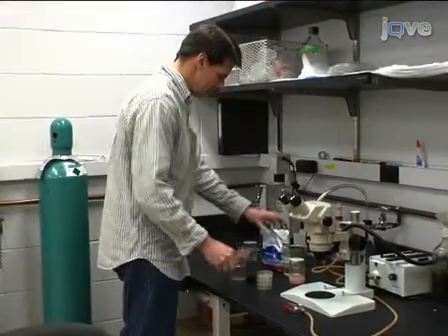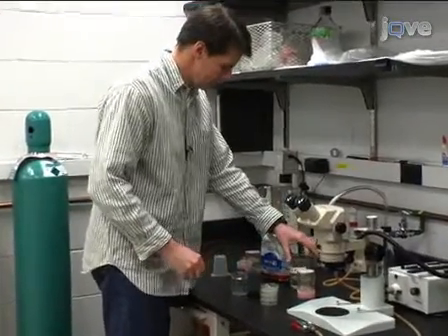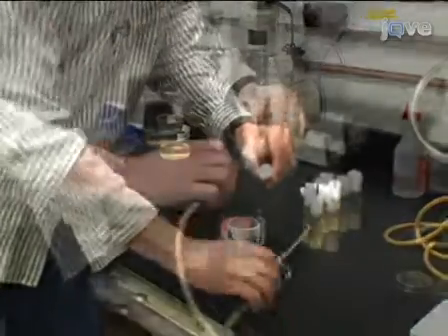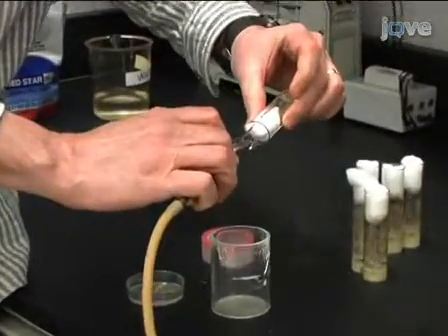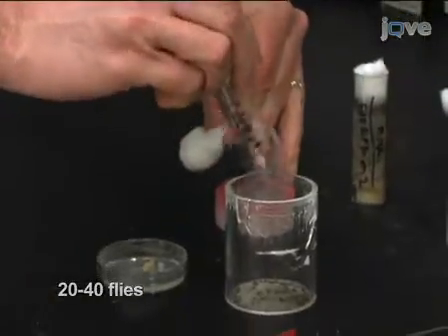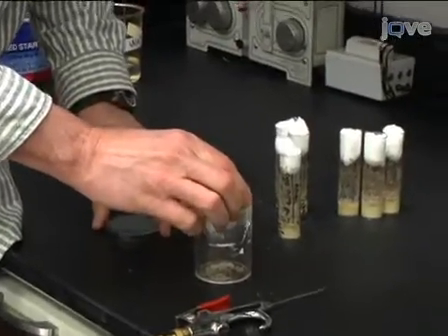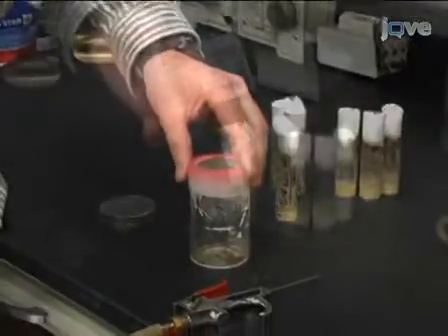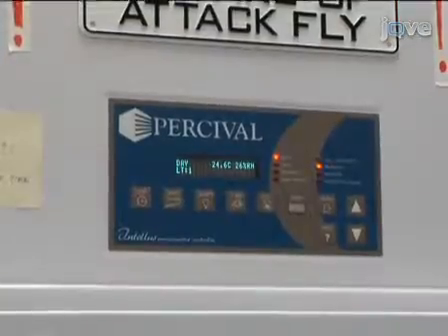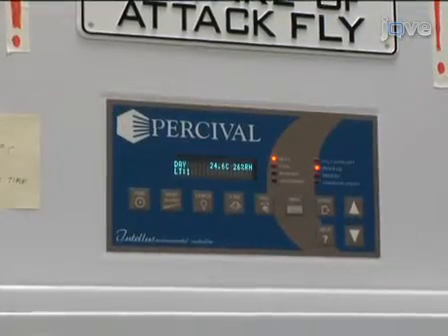This protocol begins with embryo collection, a common procedure used in a variety of Drosophila experiments. Establish a mix of 20 to 40 young male and female flies in a laying pot, and house them in a humidified chamber at 25 degrees Celsius. To accurately estimate the developmental stage of the embryo, the temperature and humidity should be consistent.